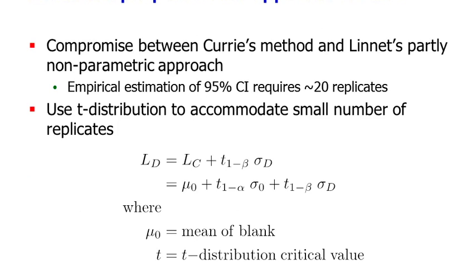So you take your calibration curve or your sample spike-ins, pick the sample with the lowest spike-in level that you had, and then use that to determine the standard deviation for the sample with the analyte, that is sigma d, and then you use your sigma naught, which is the standard deviation with blanks. And so this formula was kind of what was used to calculate LODs for the CPTAC study 9 that Sue mentioned.